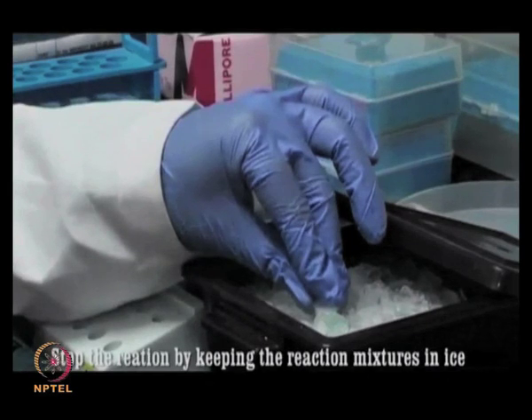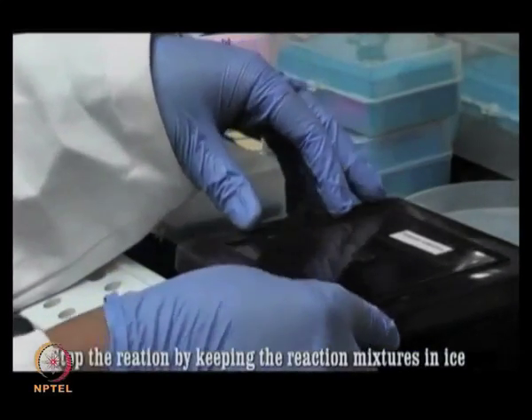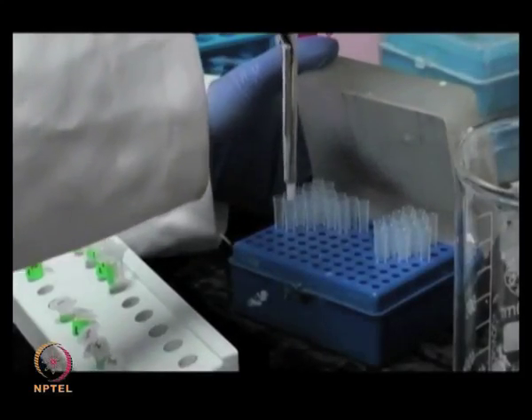After the overnight step, you have to stop the reaction by keeping the reaction mixture in ice.